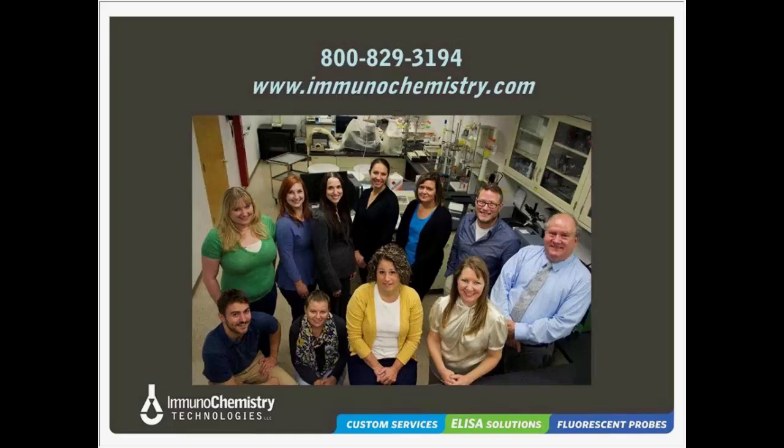So you can get your assay done in a shorter period of time. I would not trust any assays where you incubate for 30 minutes or less, because you want to be sure that you're going to capture everything. And if you're on that steep part of the curve, you don't dare stop that assay unless you've diluted it out far enough where you're not going to be in antigen excess. So I would say typically it's at least an hour. Usually it's like 90 minutes, and if you put it on a shaker, you can cut that time by a third or so, and that's at room temp.